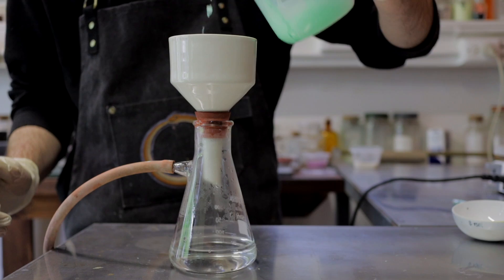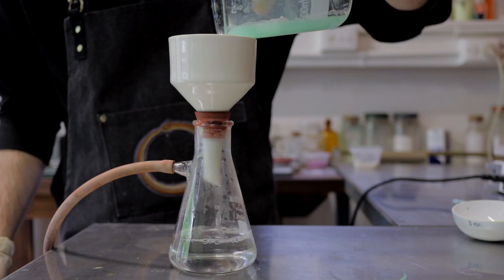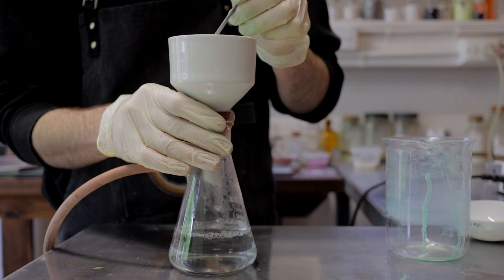One of the advantages of filtering hot is it makes filtering very quick. We're also going to rinse it with some extra hot water to clean out any excess sodium bicarbonate that may be in there, just to give us a nice clean pigment when we're done.